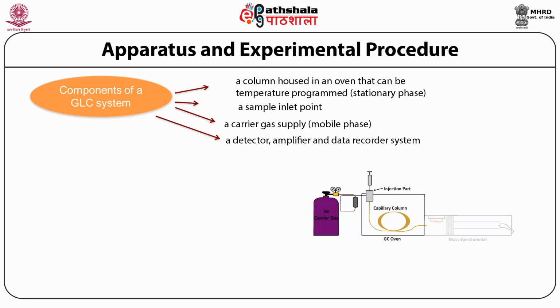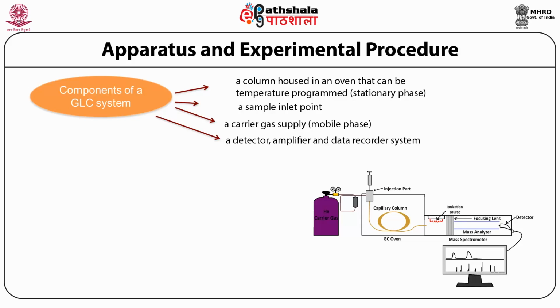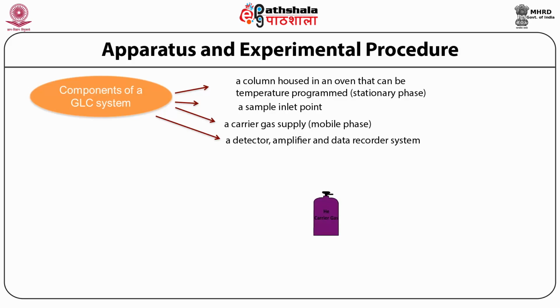These peaks that you obtain out of a mass spectrometer are then compared against a database which has about 200,000 to 300,000 molecules listed in it. And then, after the comparison, you will find out which peak corresponds to what molecule.